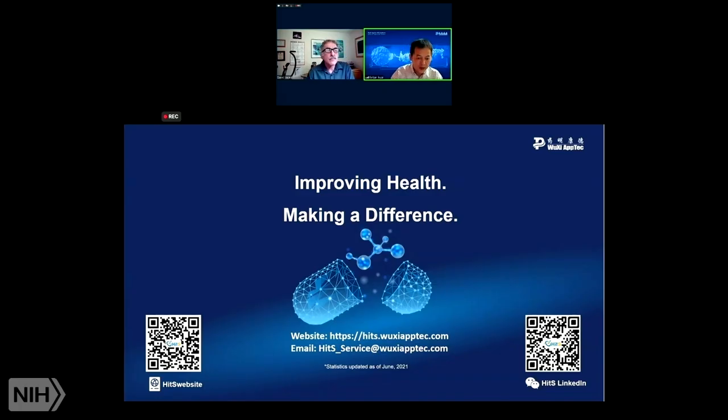But it's okay to take a portion of your selection outcome and send it to the sequencer. In that regard, I would recommend to take out no less than 10%. If your selection output is way above your sweet spot, then I would recommend doing another round of selection.